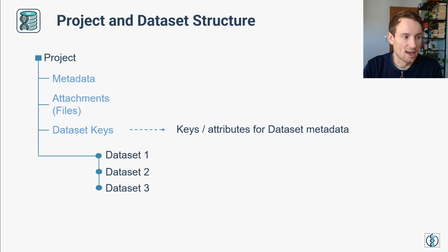Next, we have the projects, and the projects are a structure that holds different datasets. This is meant to group datasets that belong together or that should be analyzed together into one logical unit. So a dataset can be part of different projects, and different projects can have multiple datasets. So this is very flexible.